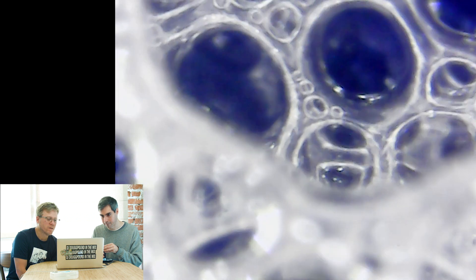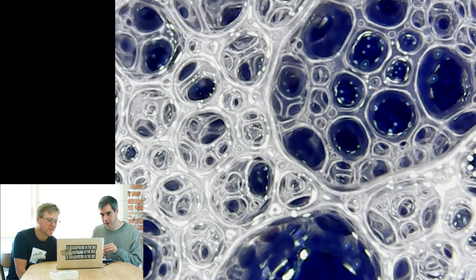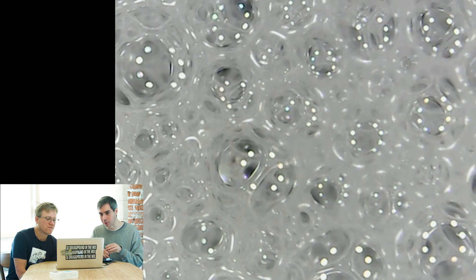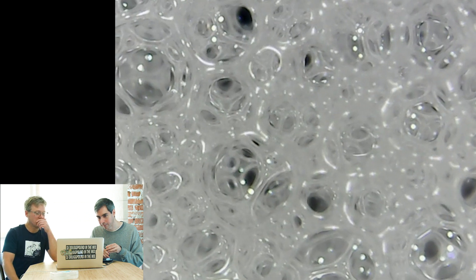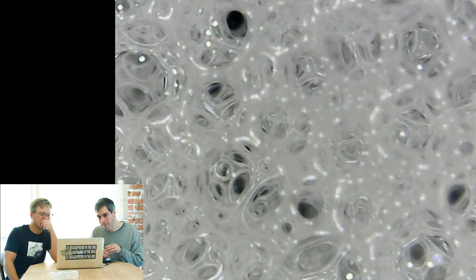The closer you get, the more bubbles are revealed. There are bubbles in there you can't see with the naked eye. You zoom in and in and in. It's neat to see them kind of moving a little bit. This is a more dense area of bubbles here. Wow, look at all that. That is so cool. It's neat to see them moving and kind of popping and stuff.